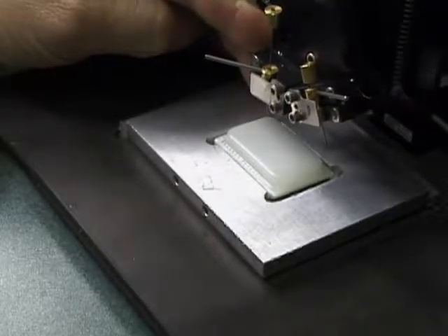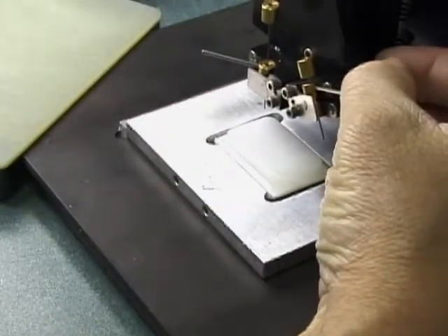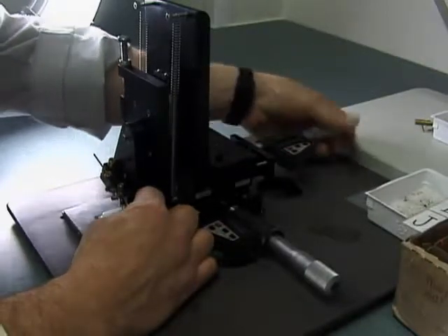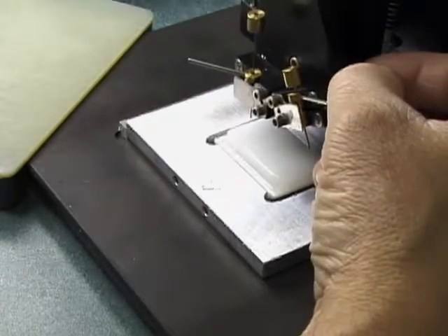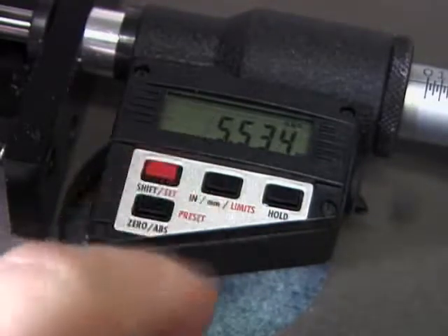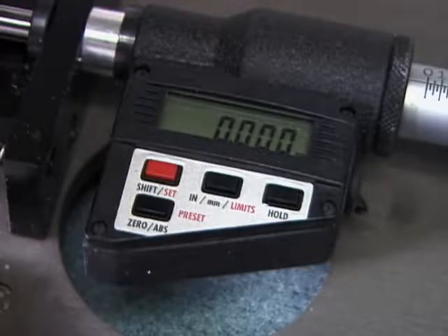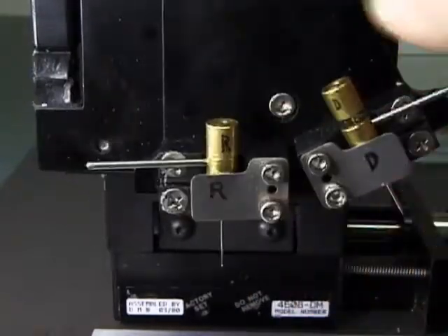Using the micrometer adjustment guides, maneuver the needle to the location you desire to begin punching. It is best to begin punching at either the top or bottom left corner. The adjustment knobs can only travel 2/3 of the way across the block. You have to flip the block to punch the last third, which I will explain later. Zero the guide counter before punching. The distance between punches can be 0.6 millimeter to 1 millimeter apart.